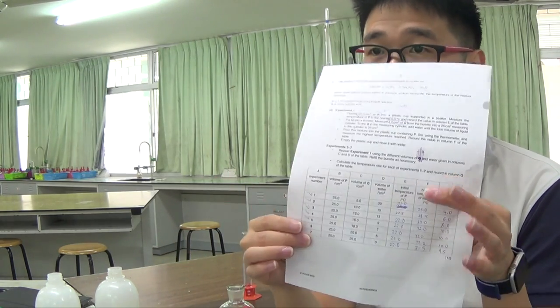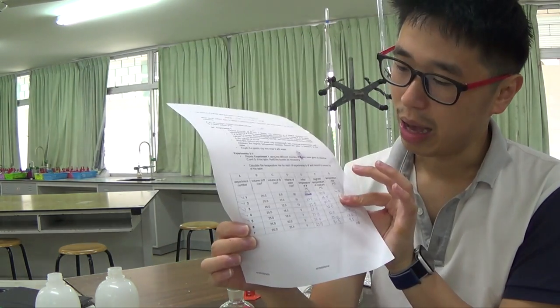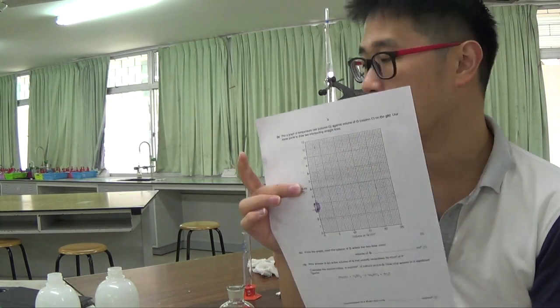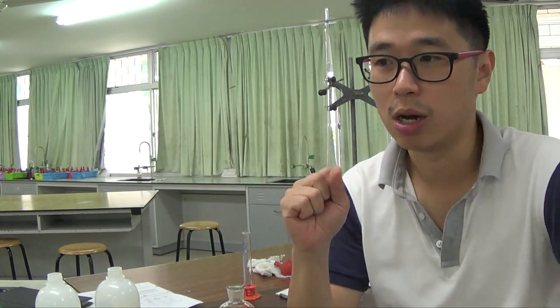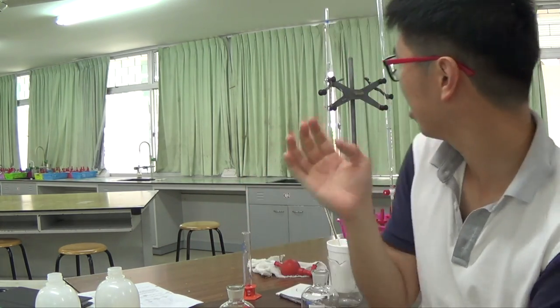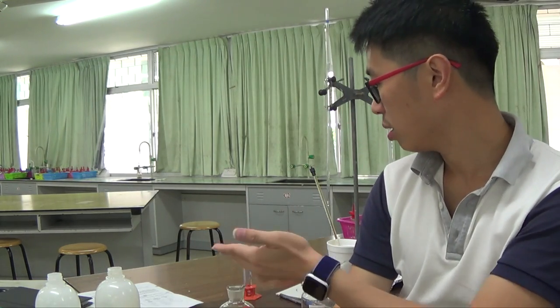If you're an A-level student, this data collection might be applicable to you as well, and of course questions in A-level will be more complicated, involving error analysis, suggestions for improvement, what else could go wrong, etc. Okay, so that's it for me in this tutorial video. My focus is on the various types of practical, the actual data collection and the experimental skills involving burette, pipette, washing, temperature, dilution, etc.